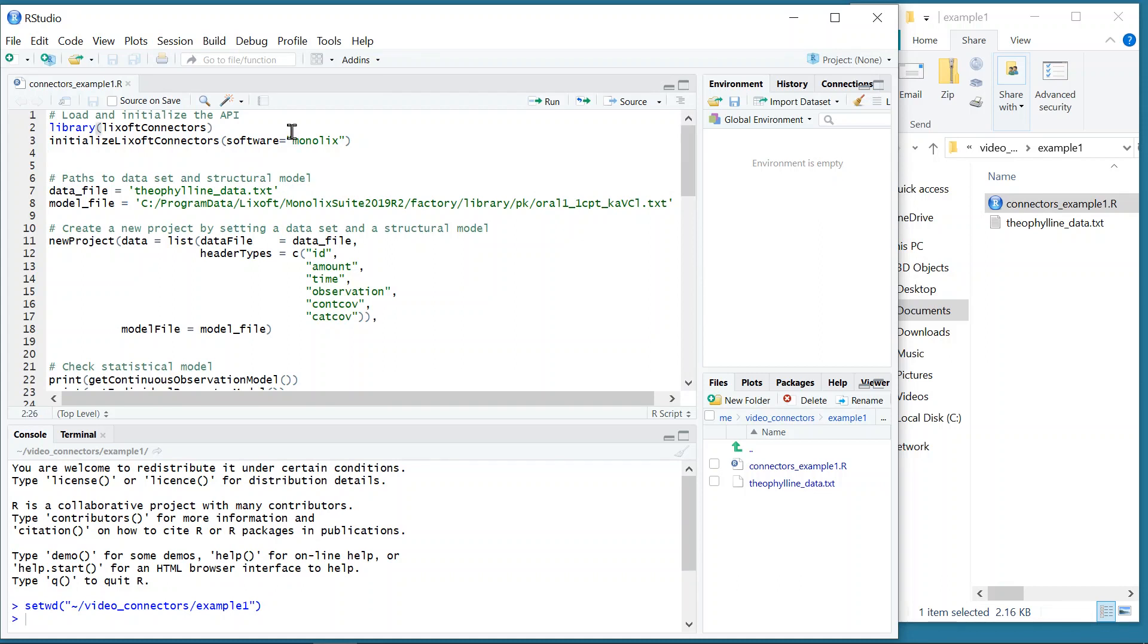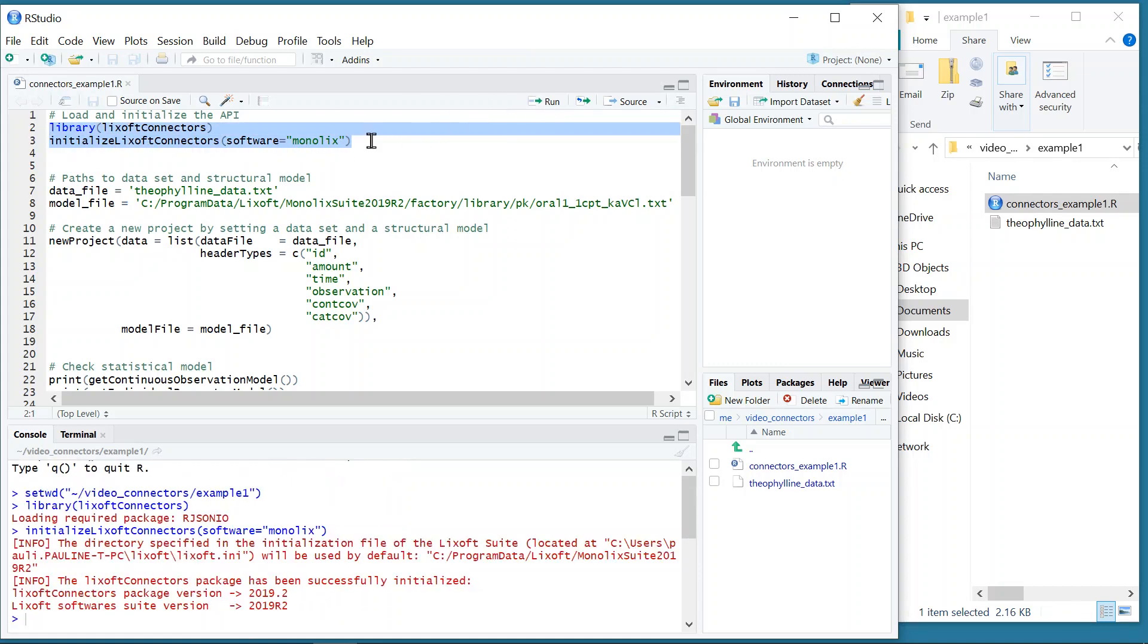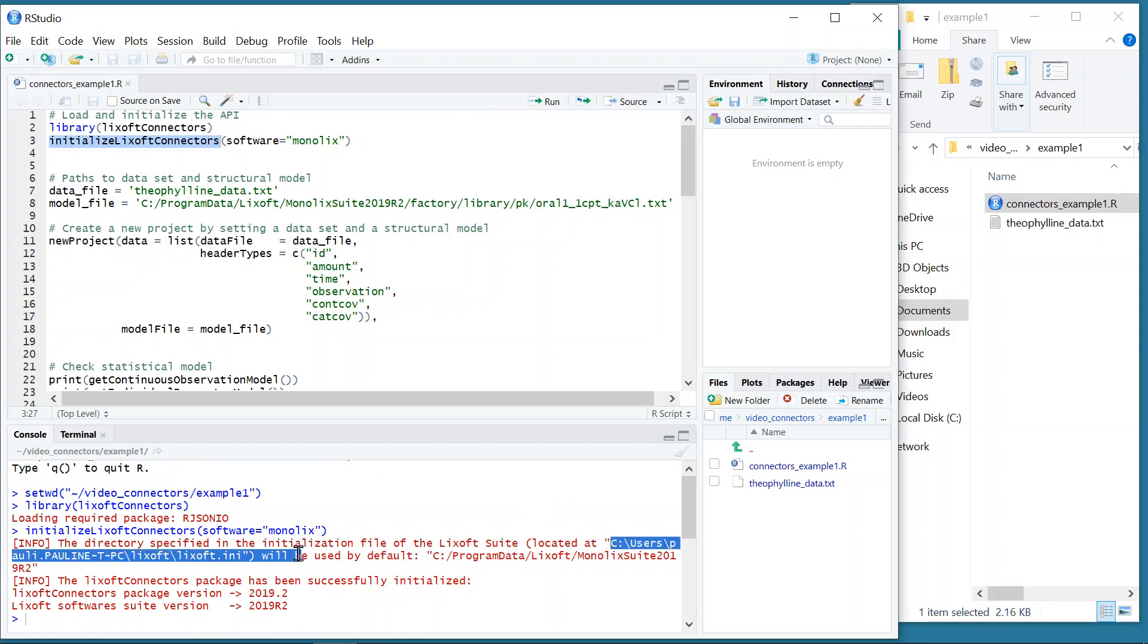The first line loads the package, and the second initializes it. This command writes the path to the installation of Monolix from this file, and checks that the path is correct. In that case, it indicates the version of Monolix that will be used.